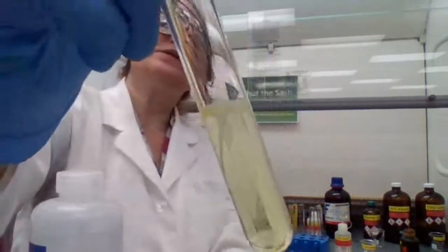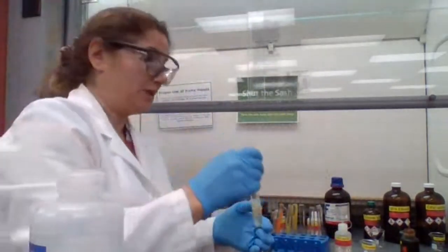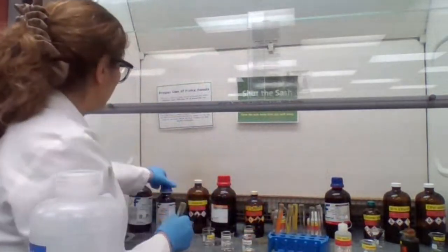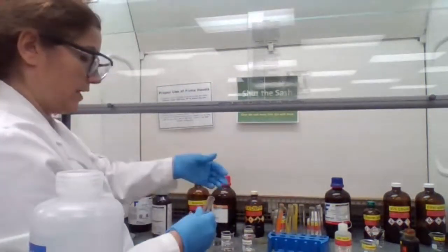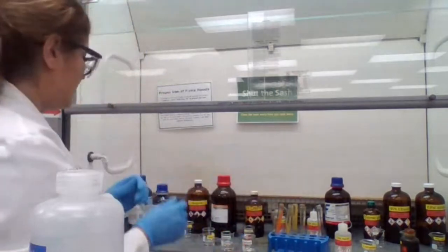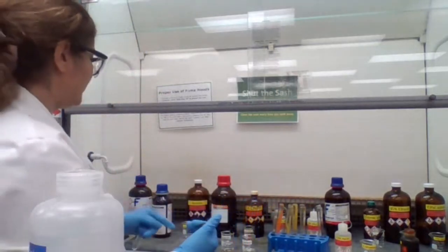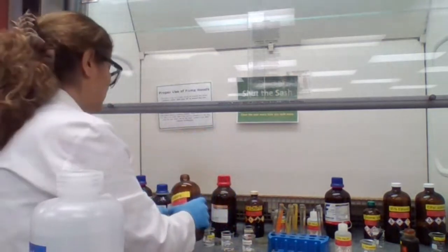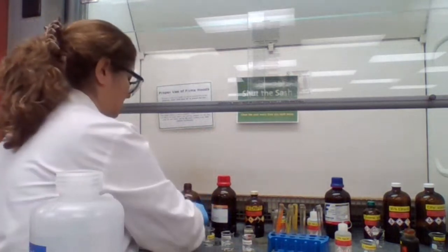Okay, a cloudy solution, and that gives a yellow color precipitate, which is formation of the iodoform with iodine and the acetophenone. Also going to try with the acetone. Acetone is probably much faster. Formation of the iodoform with acetone is going to be much faster.